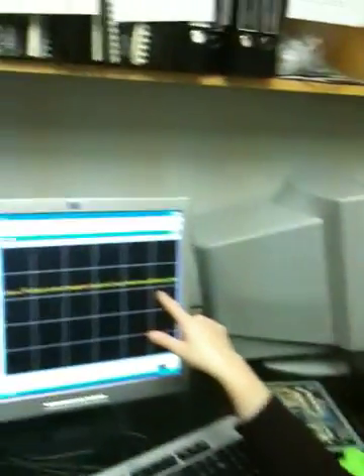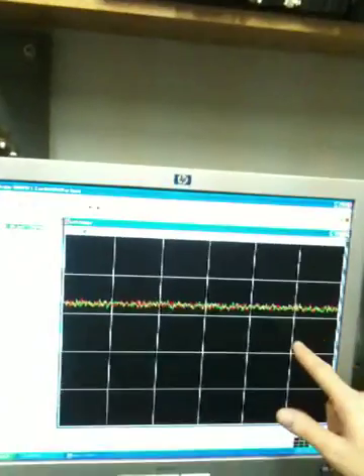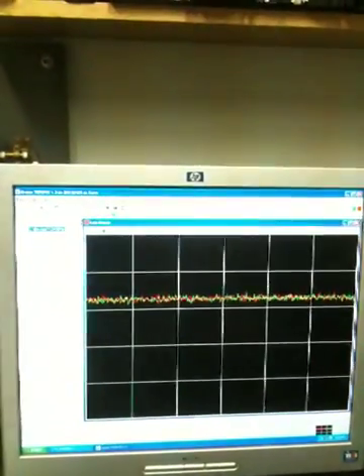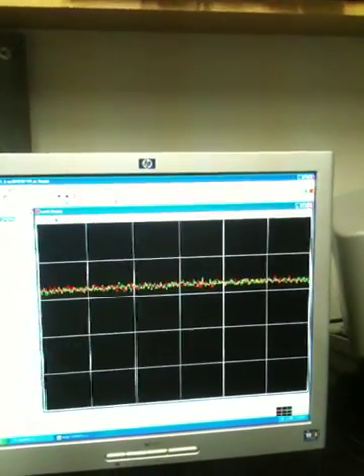So the thinner and the higher that line is, the better the deuterium signal is. And the deuterium signal is the internal monitor for the magnetic field. So right now, all I'm going to say, I could go into a big litany about this, but all I'm going to say right now is, the higher and the thinner that signal is, the stronger the deuterium signal is in the sample.